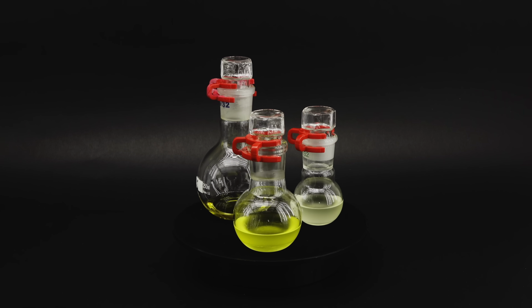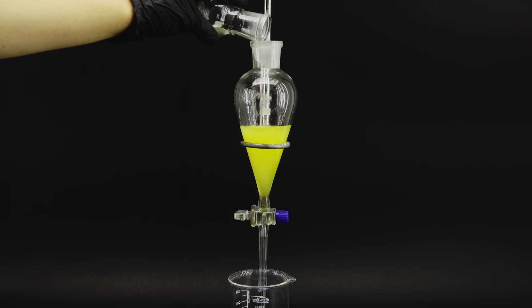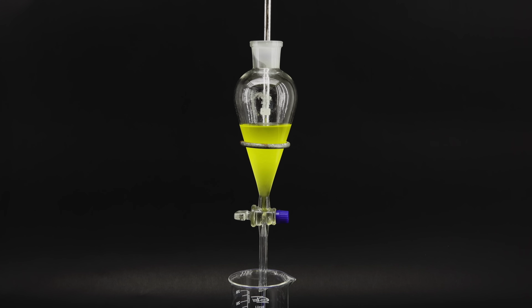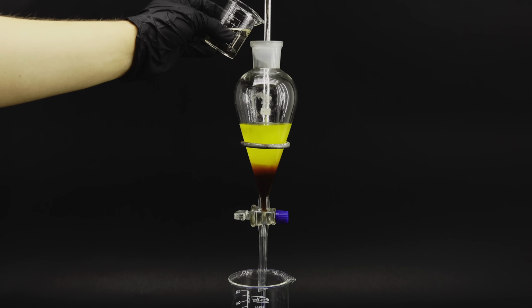For that, I whipped out this piece of glassware called a separatory funnel, and upon loading it up with all my distillate, I could now start bathing it in various chemicals. Each one should get rid of different kinds of impurities, and I decided to first wash my benzene with some concentrated sulfuric acid. Upon touching the benzene, it immediately became really tarry.